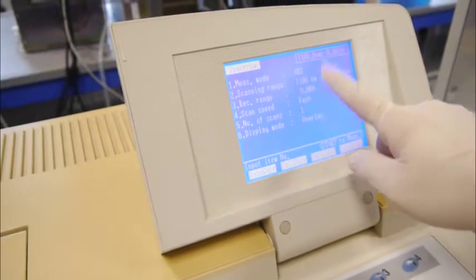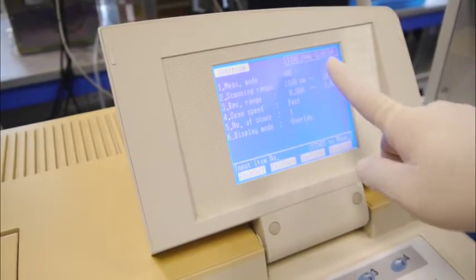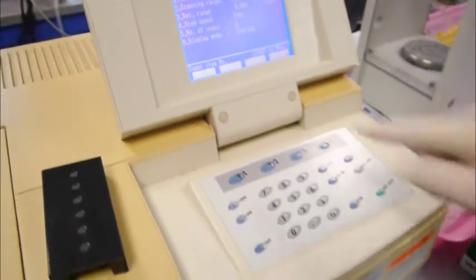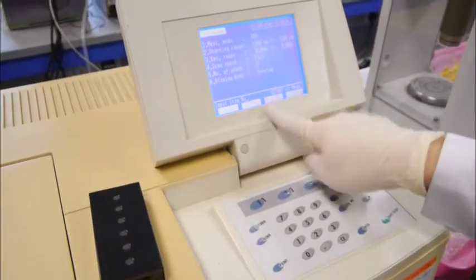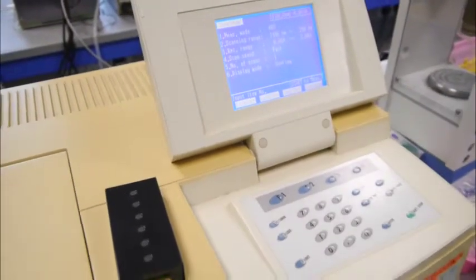If there is any deviation of the parameters from the SOP, you just set according to what you learned from single-bin spectrophotometer. Now to determine the lambda max value, we need to do the baseline correction first. So we will put in our RO water, which is our blank.